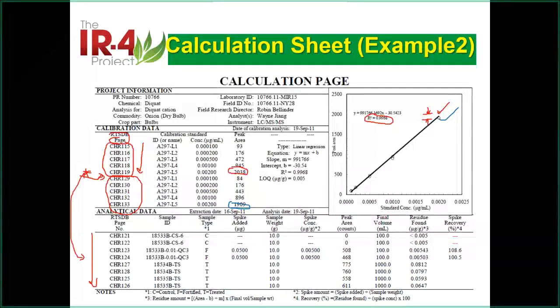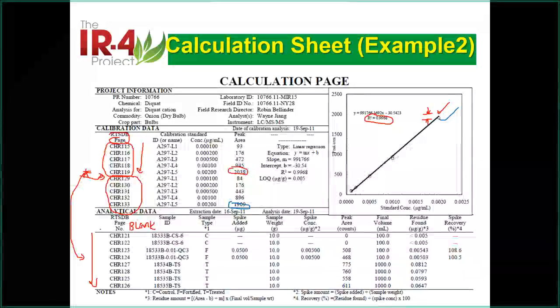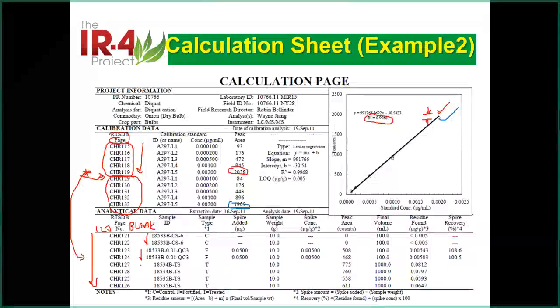You will see there will be a blank 120. We don't need to put a blank there. We know a blank should always be nothing. So the page number should be 120. Then starting at 121, that's the double injection for control on the treated sample. Then there's a QC sample, 23, 24. Then the rest of them are treated samples by double injection, 27, 28, then it's going back to 25, 26. I don't know why. Oh yeah, this is because of the sample order.